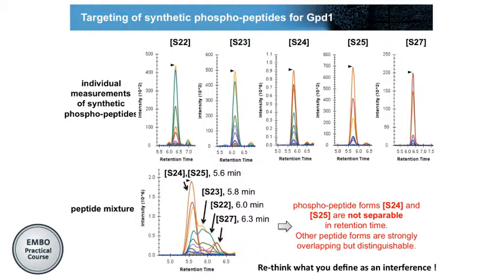And what we also need to think once we see pictures like this is, before we would tell you, hey, why don't you just remove this interference? It's quite an annoying peak and it disturbs our quantification. In this case, this is not an interference, this is the nearby elution of a separate phosphoform that is actually representing some biological information potentially.